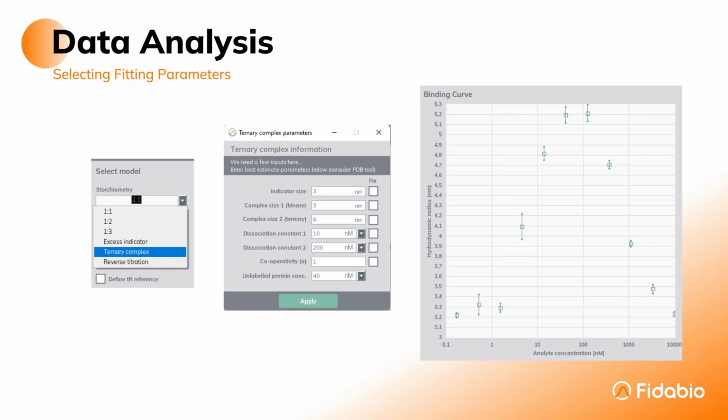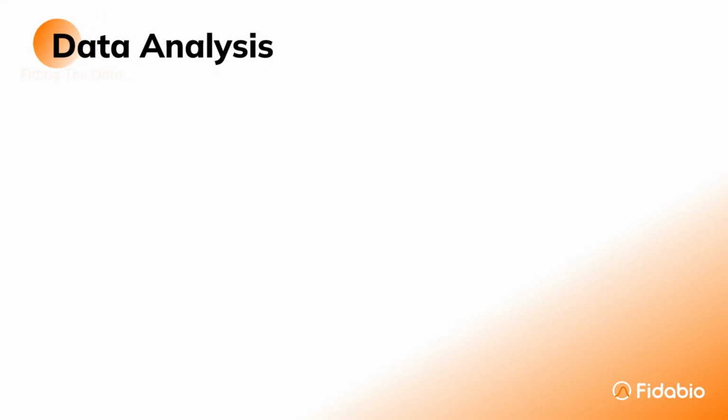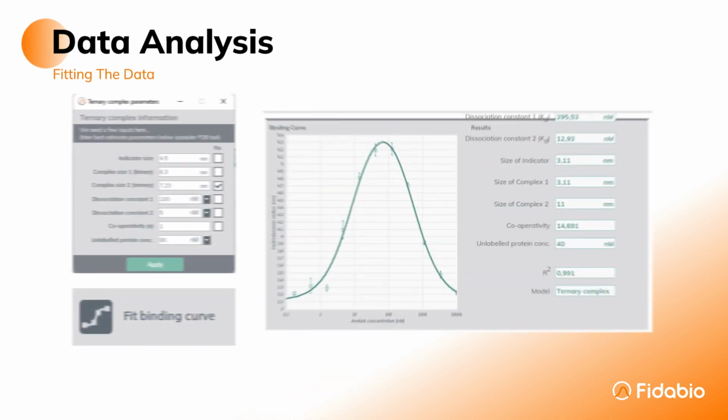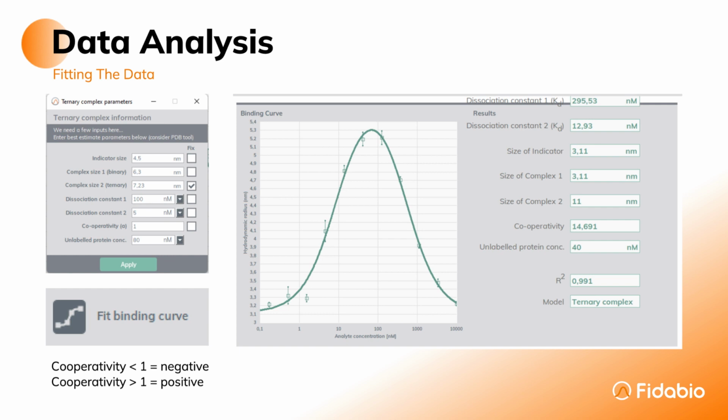A good initial guess for the cooperativity is neutral, i.e. a value of 1. Lastly, you need to tell the software the concentration of unlabeled protein in your assay. You then click Apply and click Fit Binding Curve. In this example, we have fixed the size of the ternary complex, as we have already measured it in the initial screen, allowing for a more rigorous fit. The results are then displayed on the right-hand side of the screen.